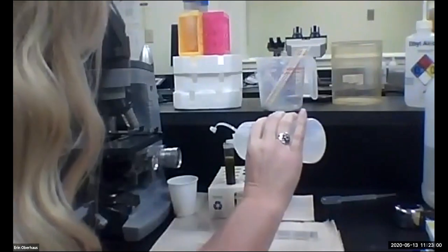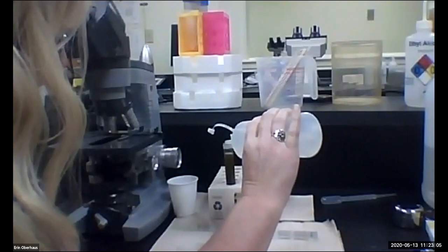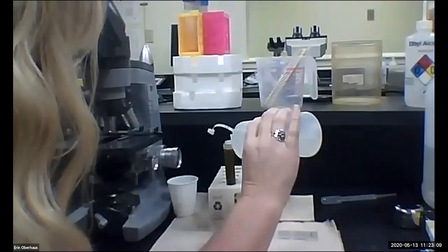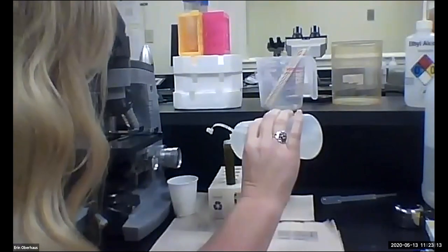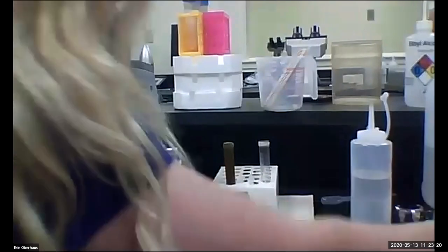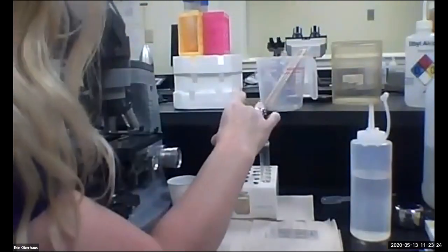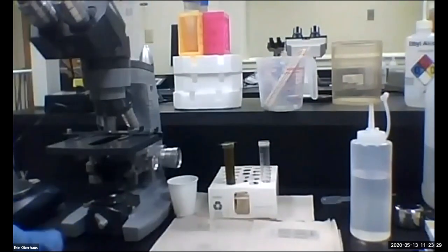And then I'm going to top this off. I'm going to go slowly so that I don't create a bunch of air bubbles. I'm going to kind of squirt it down the side of the tube. And I want to fill it up until there is a positive meniscus or a positive kind of dome over to where it's almost overflowing, but not overflowing. And then I'm going to take a cover slip and set it on top. And I'm going to let it sit there for about 10 minutes, maybe 8 to 10 minutes.